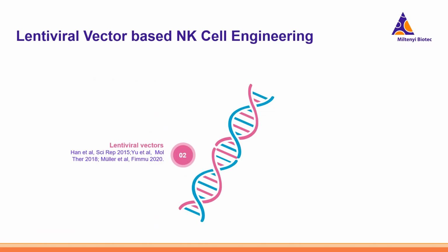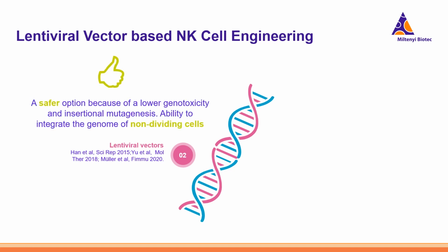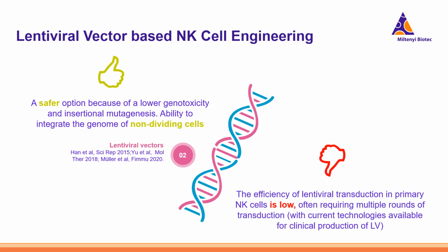I'm now coming to the genetic engineering of natural killer cells. Lentiviral vector-based gene engineering has been widely used for CAR T-cell therapies, and it has a lot of known advantages. Now, unfortunately for natural killer cells, this vector system showed low efficiency of transduction when used with the same pseudotype as for T-cells, which is the VSVG pseudotype.